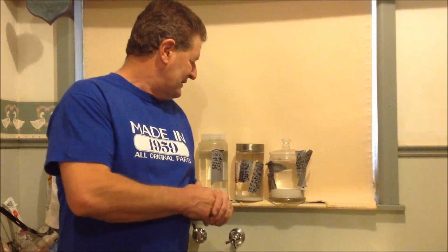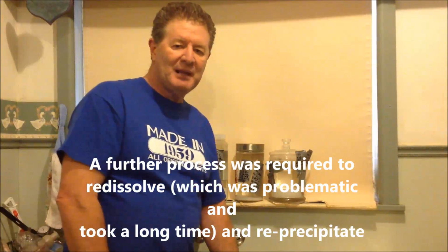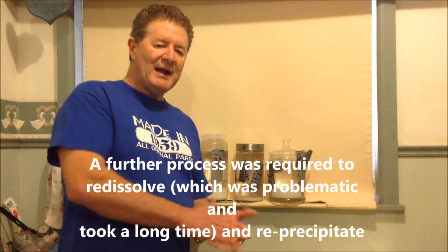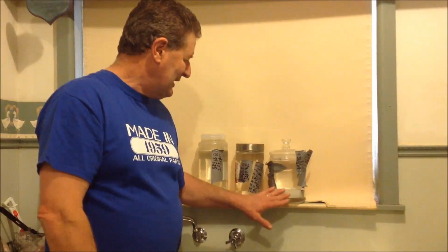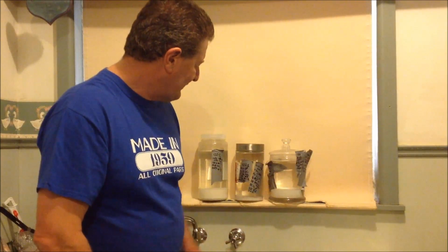I was trying to go very slow on the precipitation, and what happened was it overshot, which really underscores the point that for doing it at home, the more processes you put in place, the harder it is to do it without it going wrong, particularly around the change in the pH. It's so steep that if your reaction is taking some weeks, yes, some weeks, and you're not there the very minute it starts to go across the pH scale, then you're going to miss it. It's going to overshoot, and that's what happened in that case. And so I had to take it back and start again.